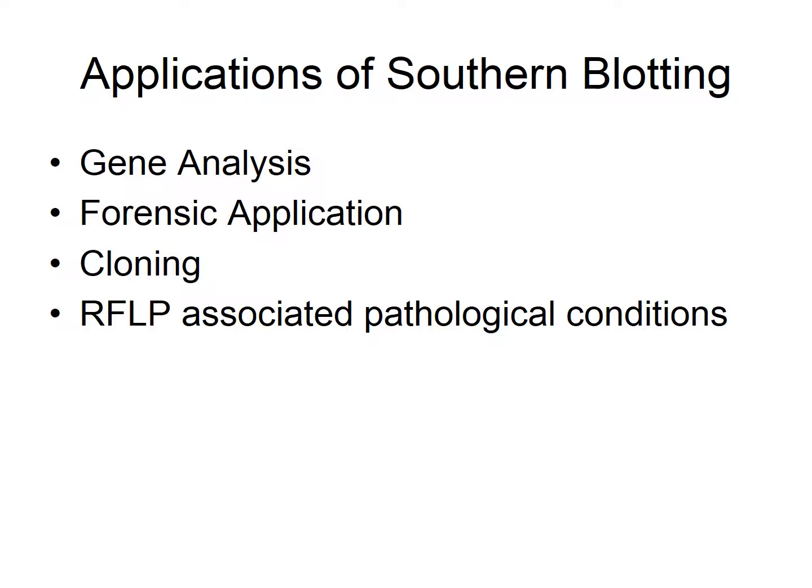And if the patient has got sickle cell disease, this probe will bind to that particular sequence with a defective gene. And when you radiograph it and you see the particular probe being fixed onto that particular small sequence, you know that this particular individual is carrying a defective gene. So that's genetic analysis.